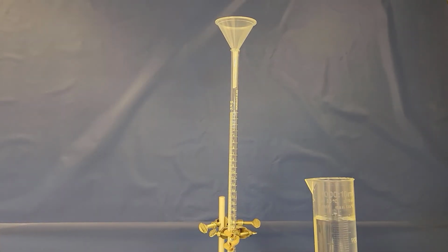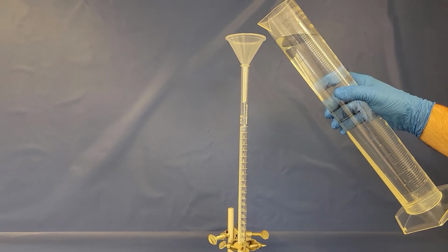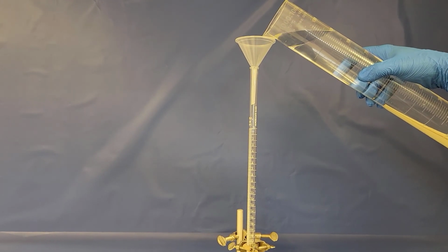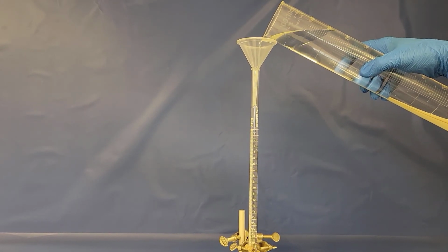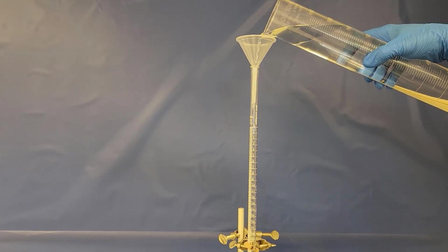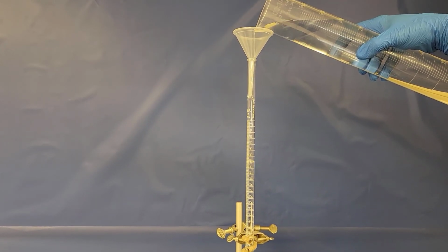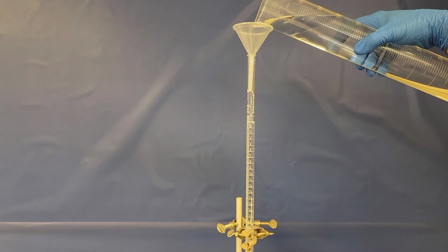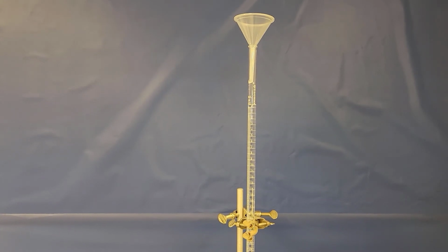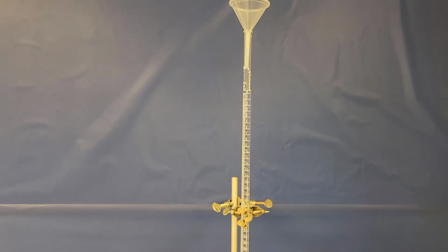All right, so we have our acid solution. I'm going to slowly pour that into the burette. We need maybe 50 milliliters here, so that would basically be filling this burette up to determine how that affects the irrigation water. So I'm going to slowly fill this up. Looks like we're at about 25. So we're a little above zero there. Okay, I'm going to leak a little bit of that out to get us right at zero, so that way we have a good starting point.